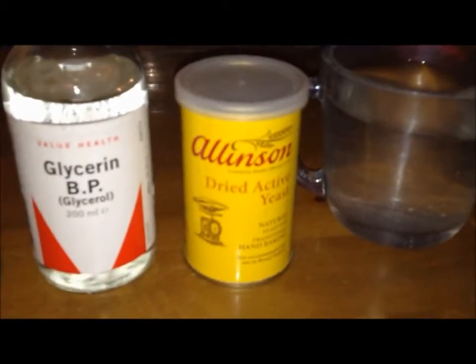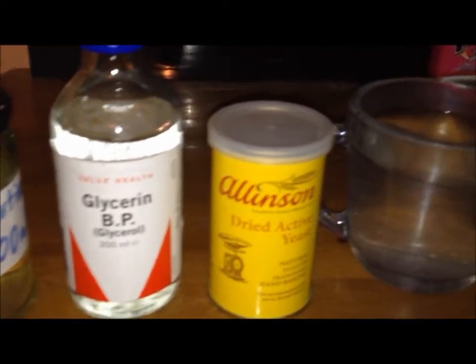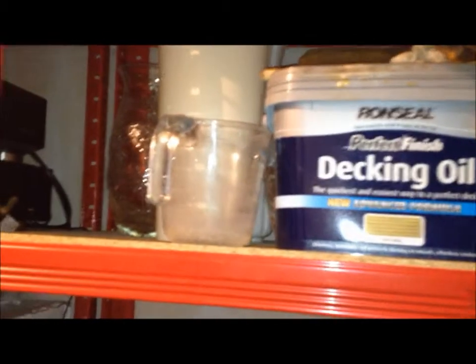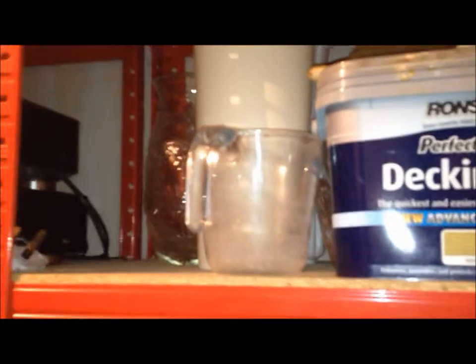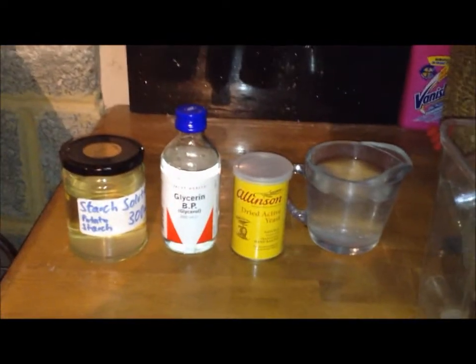Next is yeast — the only experiment I use this for is elephant toothpaste, as a catalyst substitute for potassium iodide which I've run out of. And then finally water. That water in there is distilled water which I use for my experiments, but up here I've got a bigger jug which I put tap water in for washing up. It's extremely useful and any home lab must have a good source of water.